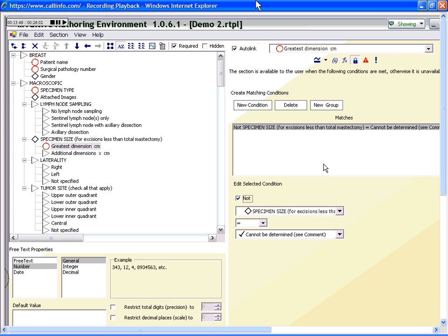And what you just saw me do is create a rule with mTuitive's Boolean conditions editor. And this conditions editor, once you learn how to use it, you have access to virtually all the dynamic behaviors in the application, including real-time alerts, conditional branching, making something required or not on the fly, and a lot of logical function type of functionality like creating choices to do things like tumor staging. Almost all of that is defined with this similar user interface. So it's very easy to learn, very easy to use, and it can be as expressive as you need to in terms of logic. And once you learn it, you can do just about anything that the application lets you do. If we needed to create a more complex rule, we could do that. I'll show you some finished examples when I'm done.